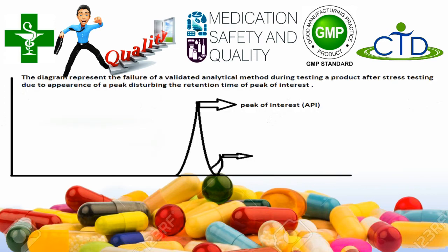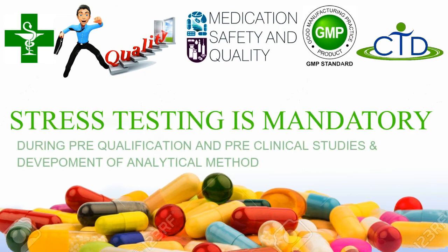The degraded impurities in the pharmaceutical product may interfere with or disturb the retention time of the peak of interest in the chromatographic results. As shown on your screen, it may happen that due to degradation, the peak of the impurity may appear in the chromatogram at the same retention time as your peak of interest, causing results to fail in the specificity test of analytical method validation.